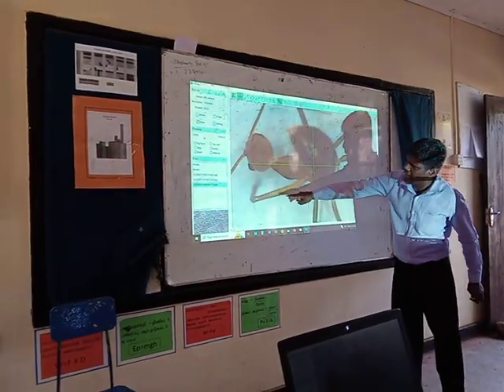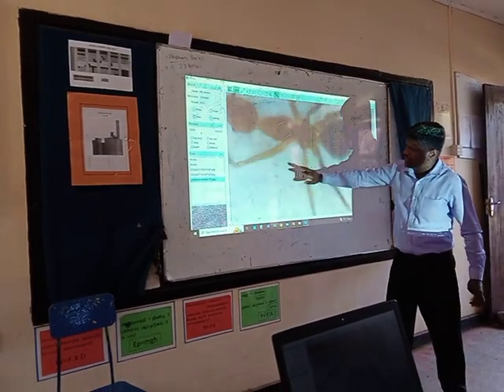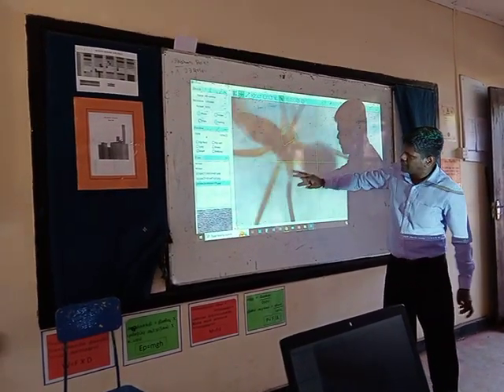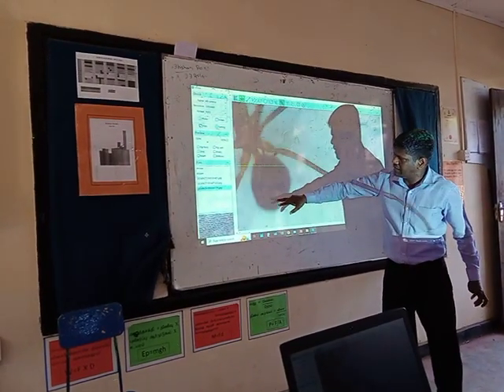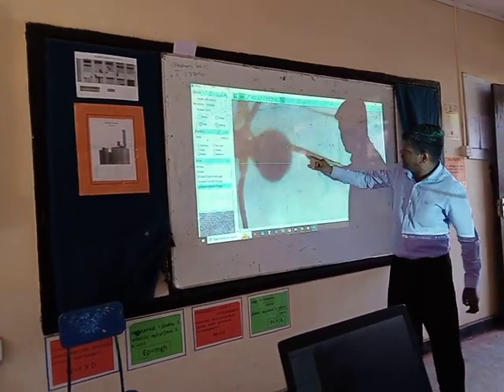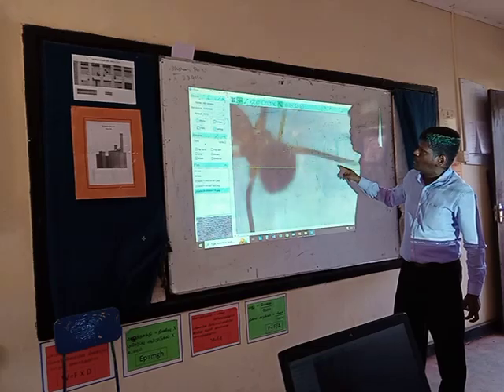The kids can watch this moment, they can see how these activities are moving.